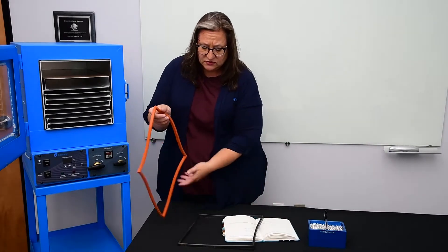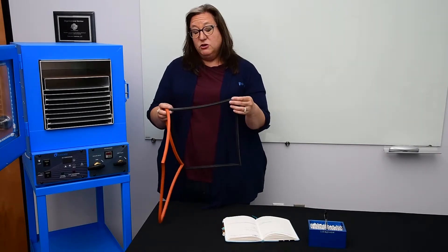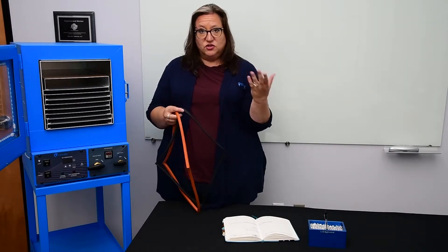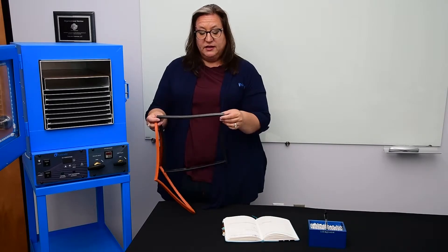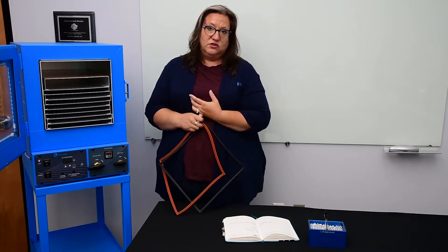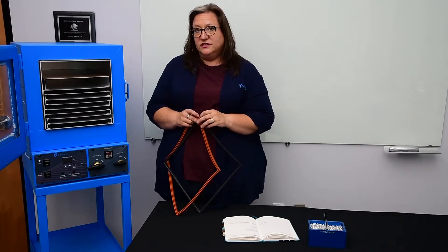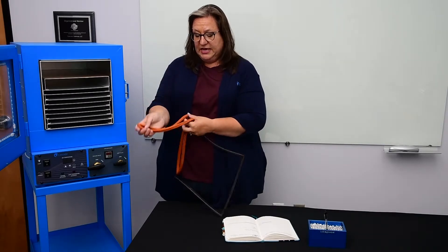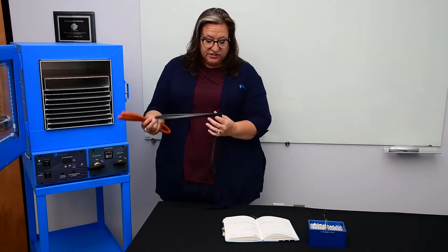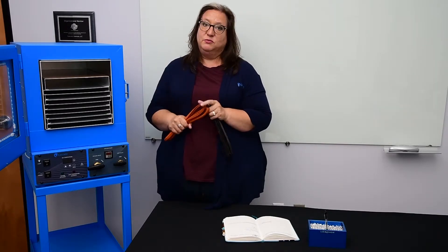You can see just the differences in these two materials here. This black gasket that comes standard with our ovens is made of Buna, or N-Buna. You can look up the compatibility chart online — just Google N-Buna, B-U-N-A, compatibility — and see that it's very well suited for applications where there is any sort of solvent present, certainly terpenes included. The silicone gasket — this orange silicone, which is also pre-off-gassed in all Cascade ovens — has a higher temperature range, about double that of the Buna.